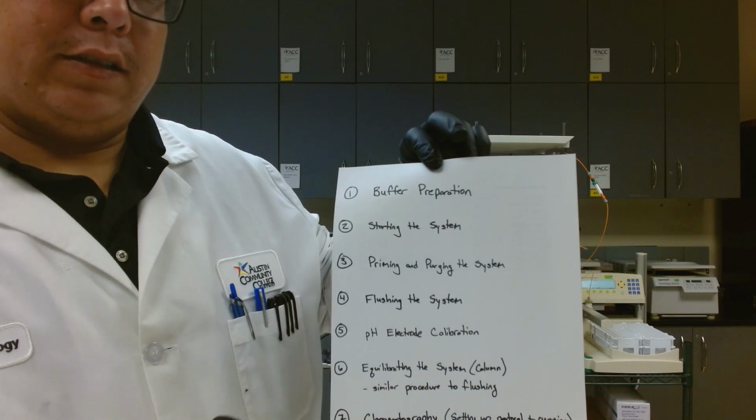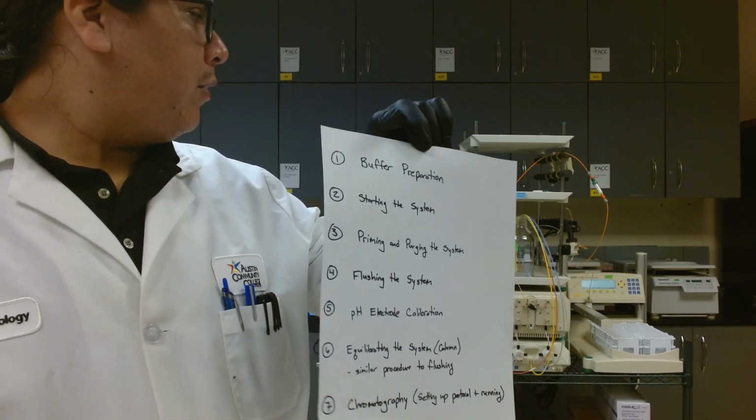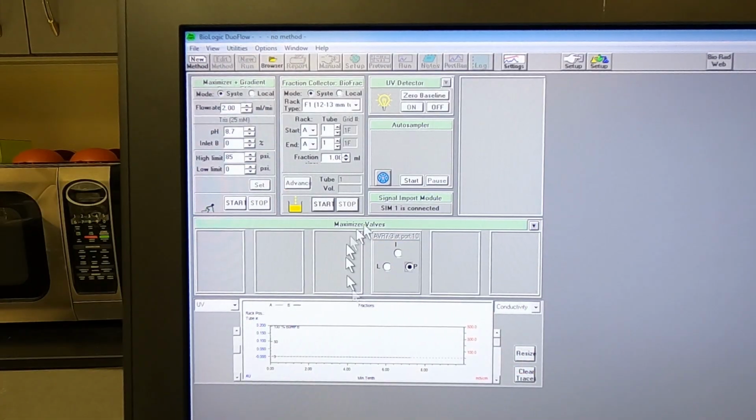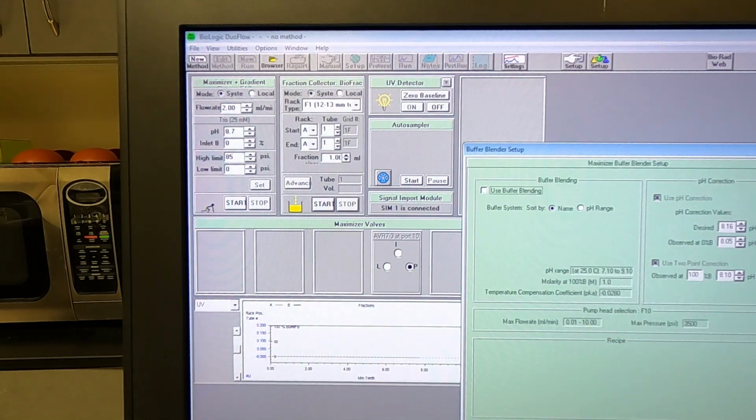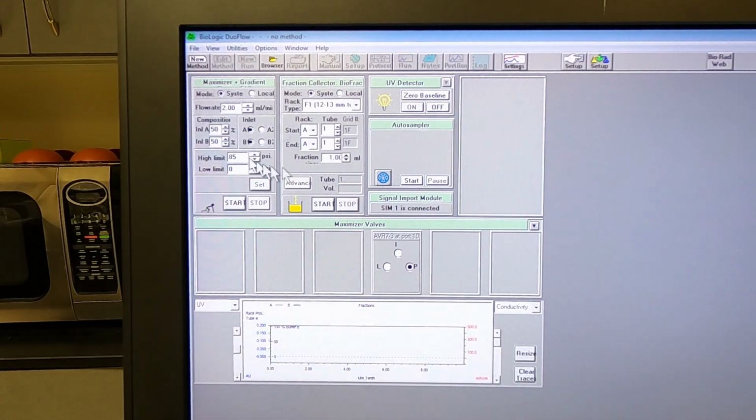Now what we want to do is flush the system. It's been stored in 20% ethanol, so we'll flush the rest of the system with water to remove any of the ethanol. Okay, so now that our system's been primed and purged with the water, what I'm going to do now is show you how to flush the 20% ethanol out of the rest of the system. And in order to do that, we'll go to our pump control module. So we're currently in what we call buffer blending setup, but I'm going to turn that off and return to our individual manual controls.